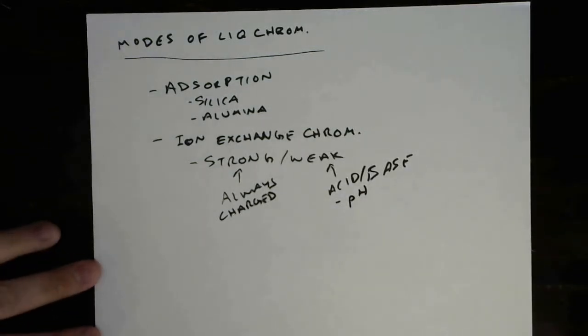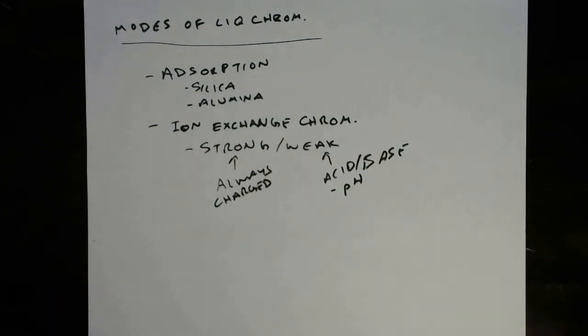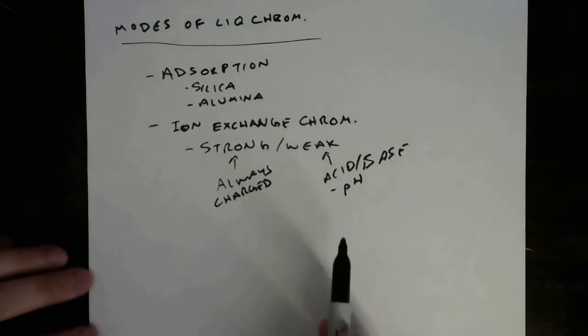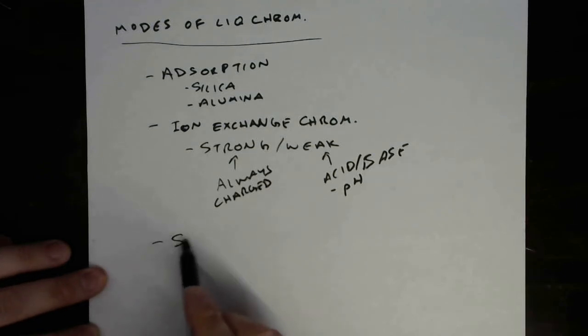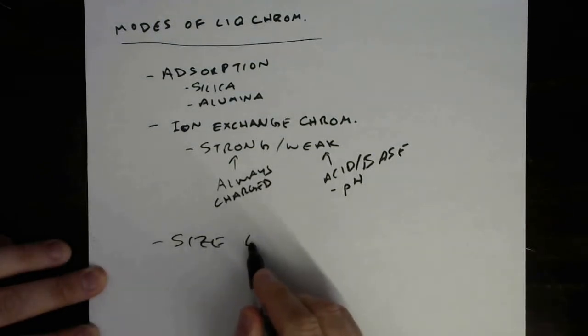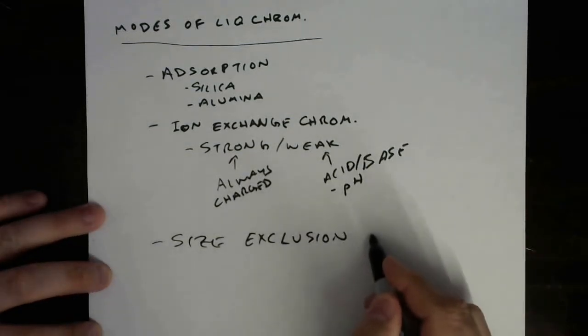The thing that we were talking about when we left, and we're just going to start back over with it because it's been a while and the entire world has been imploding on us while we've been gone, so I forgive you if you've been a little distracted, is size exclusion chromatography.